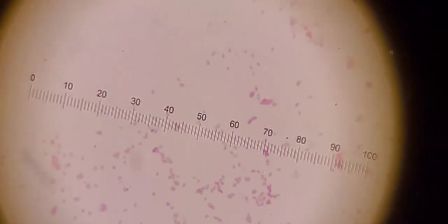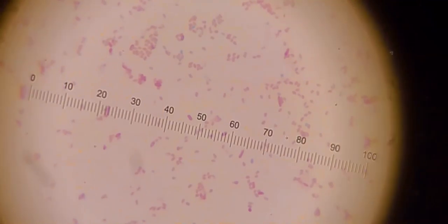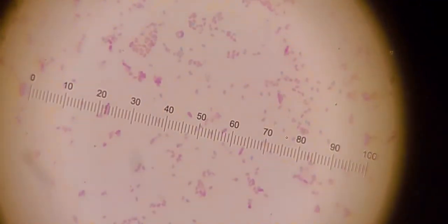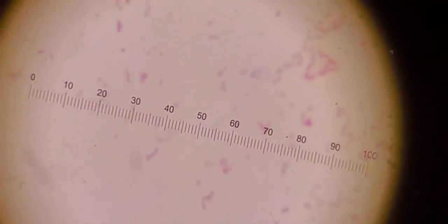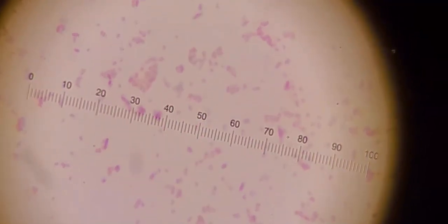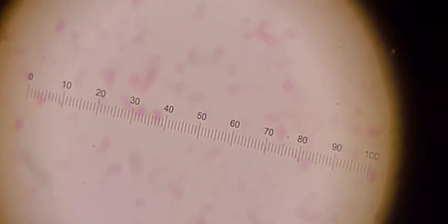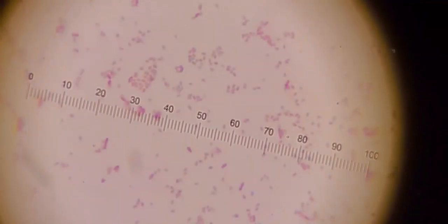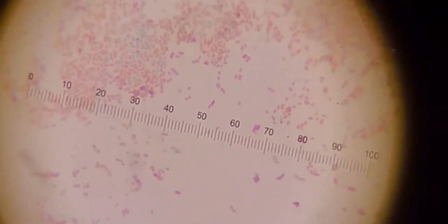On this specimen it looks like the opposite problem is occurring. These guys look like they did not make a lot of spores from scanning around. There's really only a few of them that appear to have the green. The majority of what we're seeing here is just the cell bodies that have picked up the counter stain with the safranin. We could measure these against the ruler and get some idea about the size of them. You can sort of see there is a little bit of green in some of these but not as distinct as I would like. I would like to see something that's sort of in between so maybe our unknown from the soil will allow us to see those.